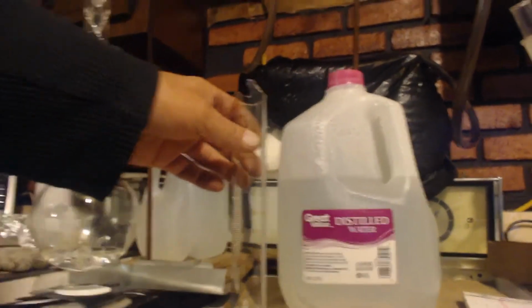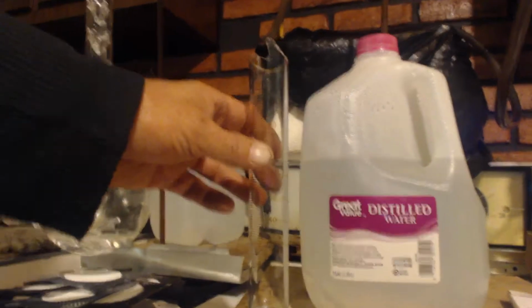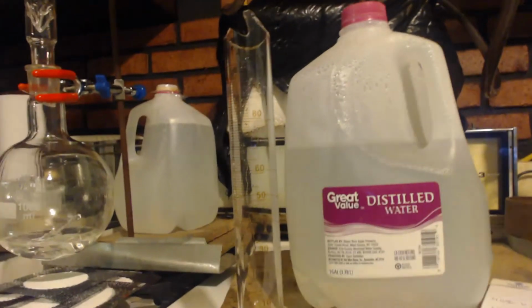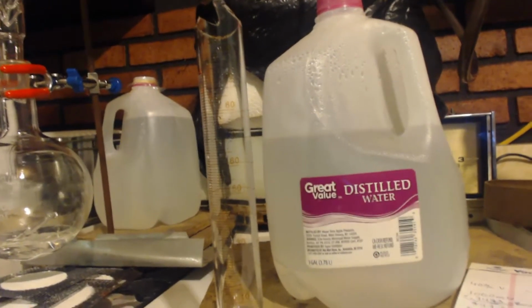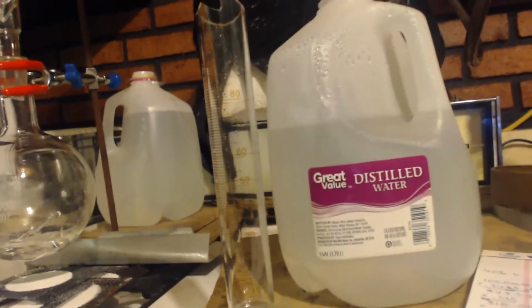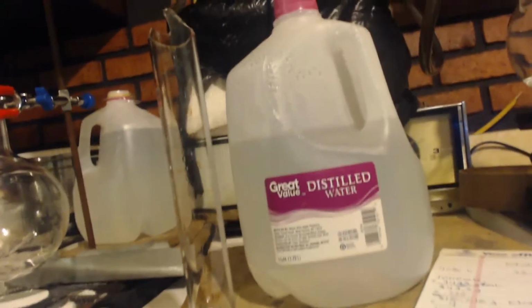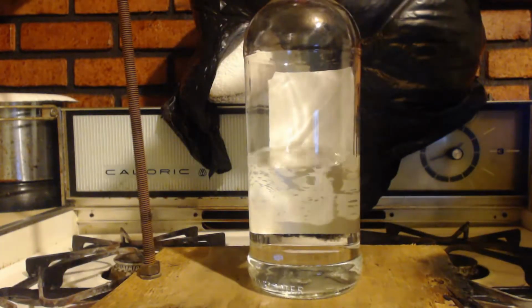Yeah, I used this graduated cylinder. Did a density test. I got a density of 0.802, and the density that I should have got was 0.804. So that's pretty much right on the money. So let's move on to the next step. All right, there's my ethanol.